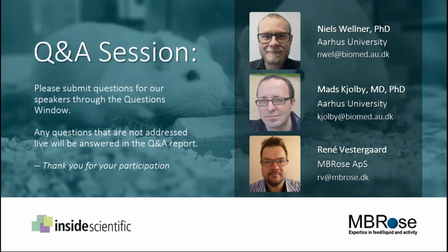Renee, is it possible to add video cameras to a system like this so that one can record social interaction between animals? Yes, we actually have a possibility to do this, to add a webcam to manually monitor the animals. So it has nothing to do with phenotyping or any other type of software combined with it at this point. But yes, we can fit a video camera on a webcam on the system to study behavior in general.